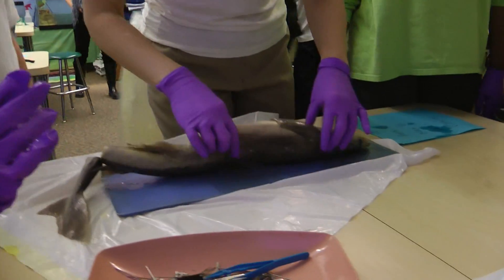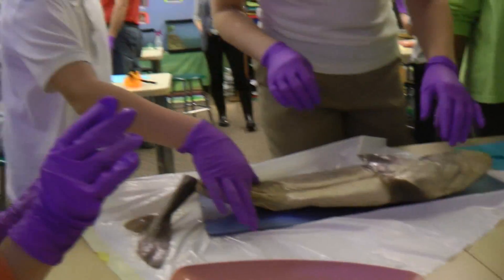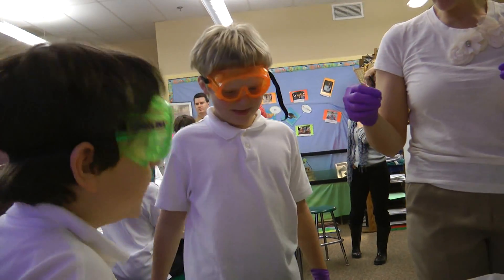Can you tell if it's a male or a female? How do you know? It's got the grippers, right?